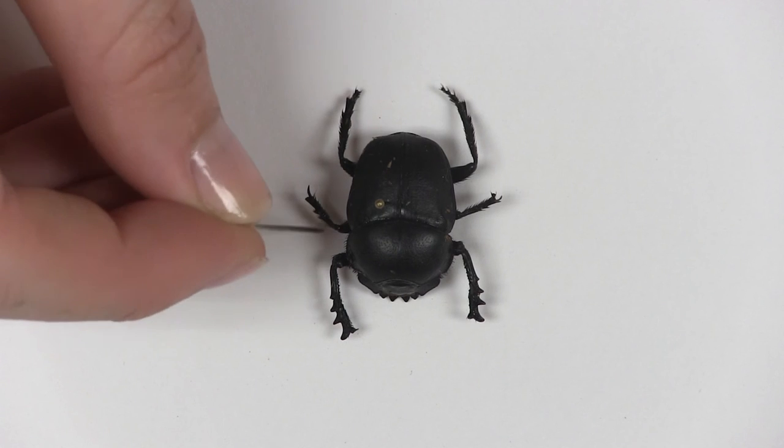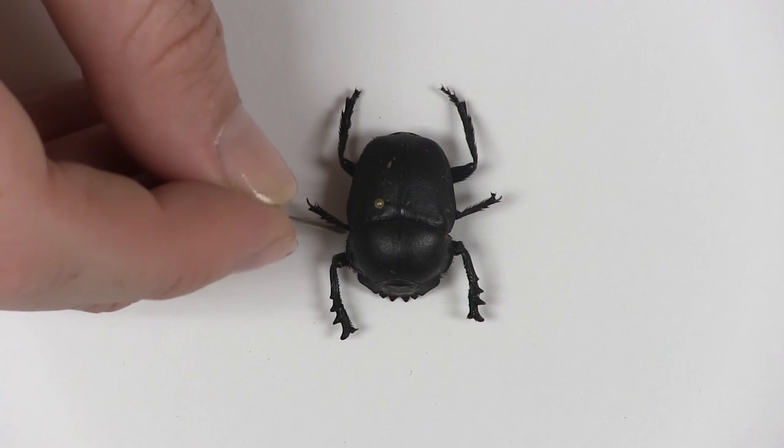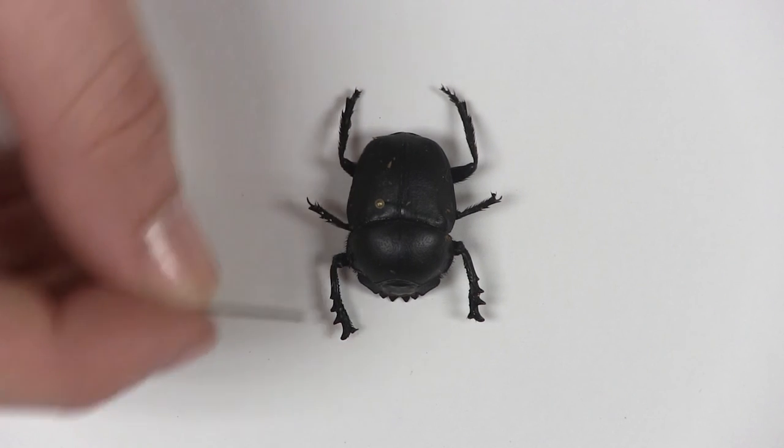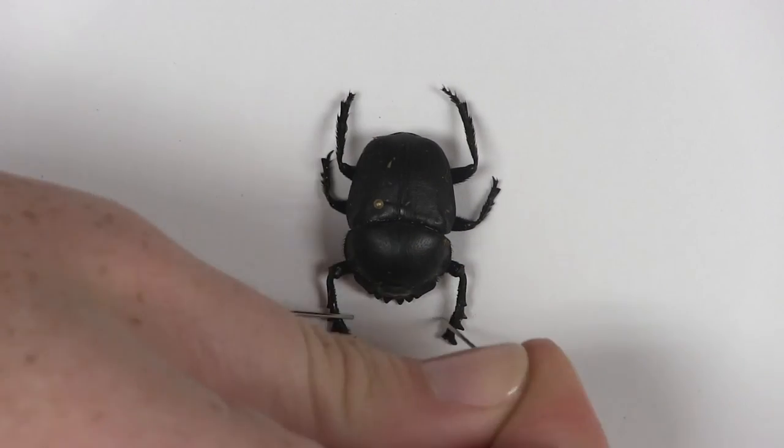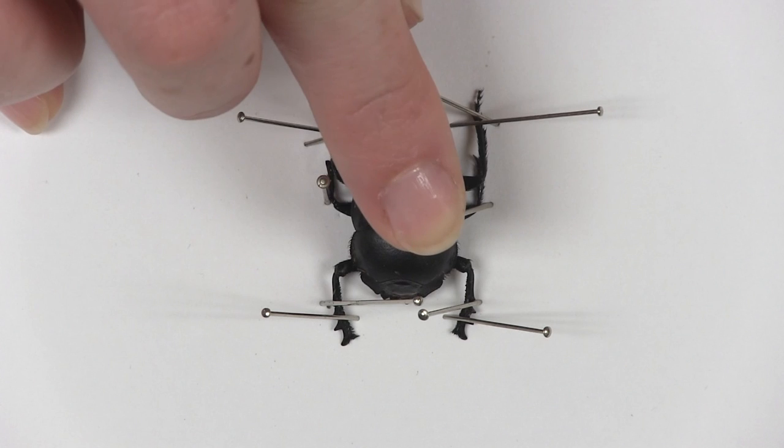Using a sharp instrument, adjust the position of the legs and antennae so that they are as symmetrical as possible and so all important features are easily visible. Use straight pins to secure the legs in the correct position.